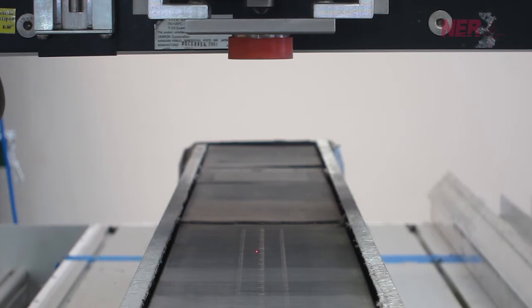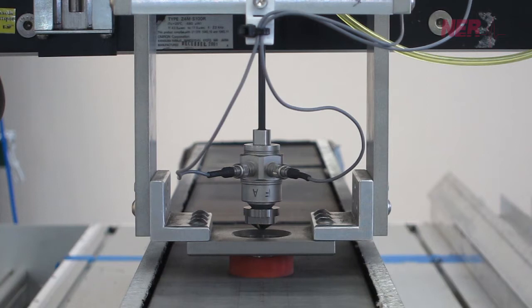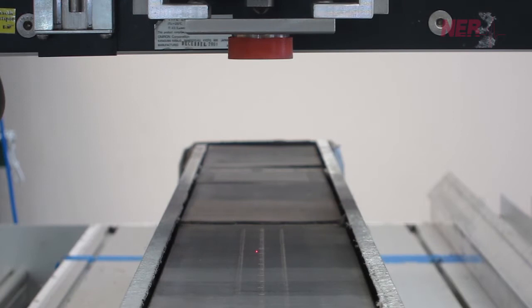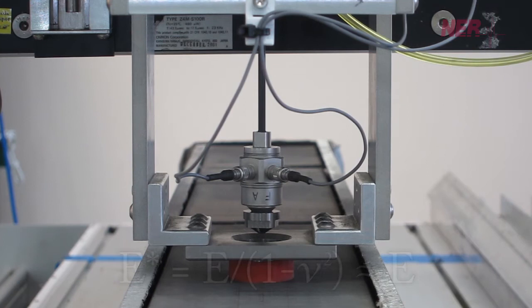The impulse hammer consists of a sensor which measures the force-time function of the impact between the sensor and the sample. Knowing the mechanical and geometric properties of the sensor and the velocity of the impact, the force-time function can be used to measure the elastic stiffness of the material. In the simplest case, the elastic stiffness is very close to the Young's modulus.